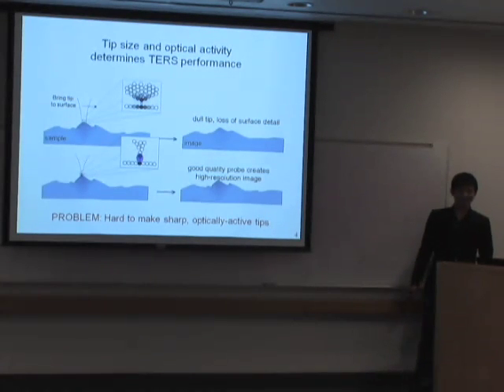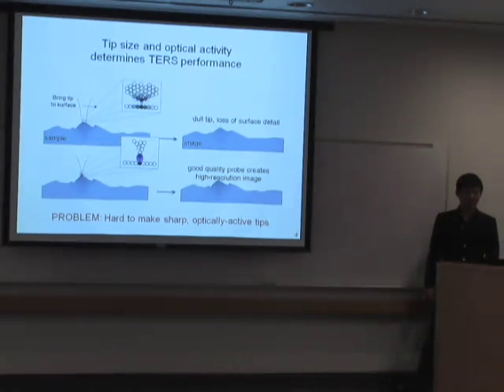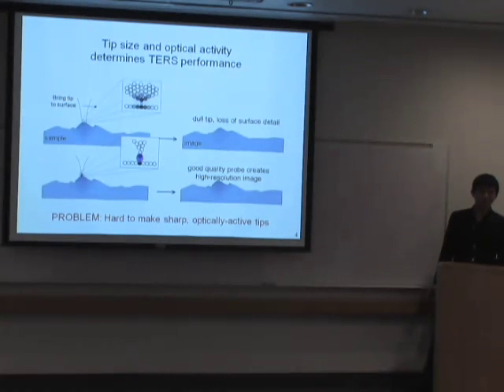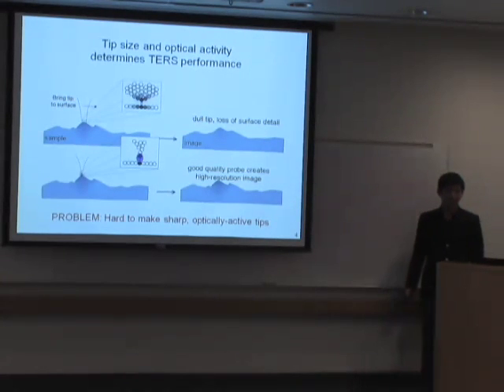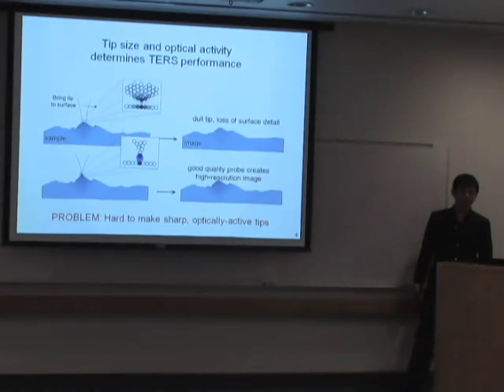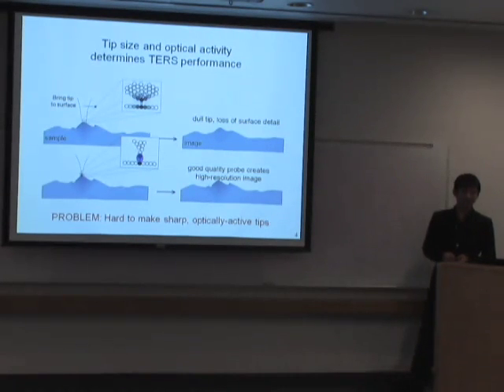So once you have the tuning fork working, what are some things you can change in the acid bath to make a good tip? Well, in the literature, most people are studying the different electrolyte conditions and the voltage, just the setup part. So the kind of setup that we're going to use is already optimized for that. And the tuning fork is really going to tell us how the tip is going to look after we etch. Okay.